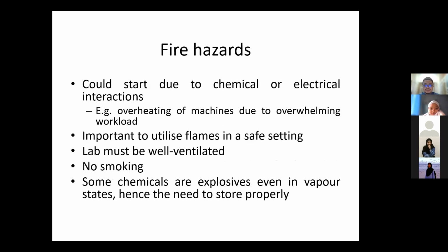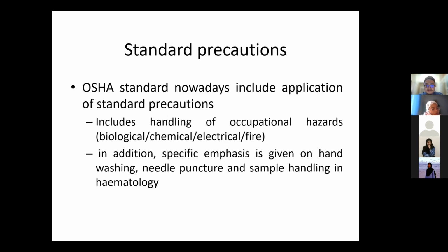Okay, fire hazard could start due to chemical or electrical interaction. It is important to utilize flames in a safe setting. The lab must be well ventilated, with no smoking. Some chemicals are explosive even in vapor states, and they need to be stored properly.